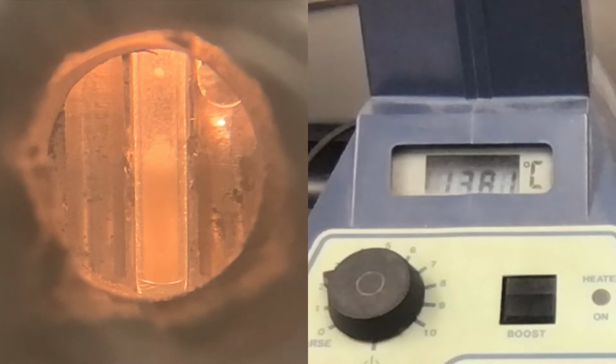As always, you may fast forward through this video and rewatch it a few times to get to the points where you think you have the beginning of melting and final point of melting. You don't need to play the video really slow for the full 15-20 minutes.